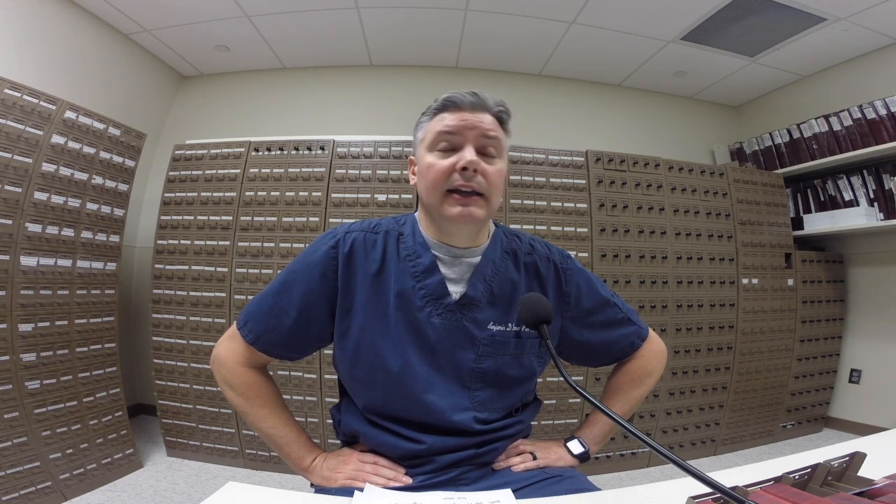A large trash container kept really close is important. I don't want to have to push a lid open or take a step to throw things away. Trash is probably the closest thing to me — just as close as the specimens. I don't like putting a lid on my trash can, so I change it often, which is fine. Keeping a trash can close and convenient is very important.